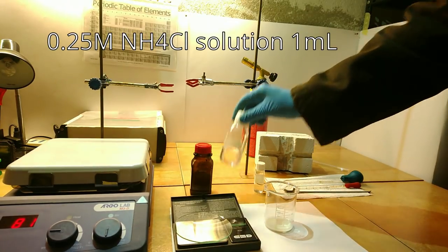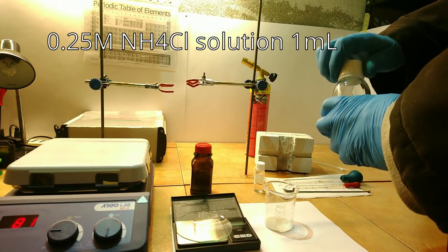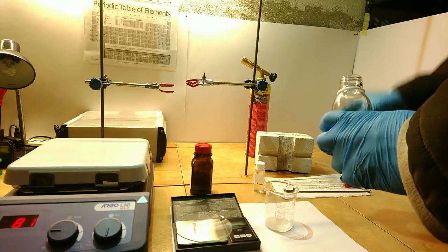Then add 1 milliliter of a 0.25 molar ammonium chloride solution. This will serve as a flux.